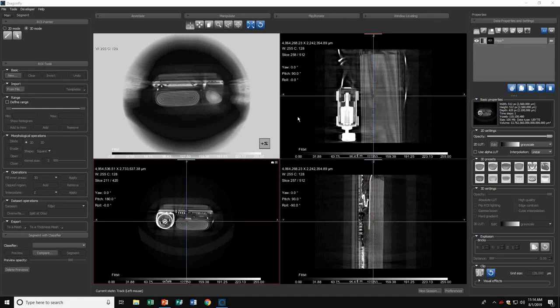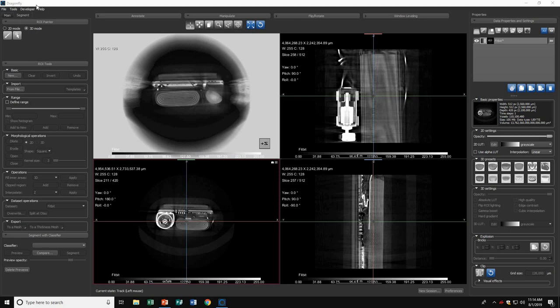Hi, welcome to the Dragonfly tutorial on region of interest. The region of interest is under the segment tab in the left-hand corner and all of your ROI tools will appear here.